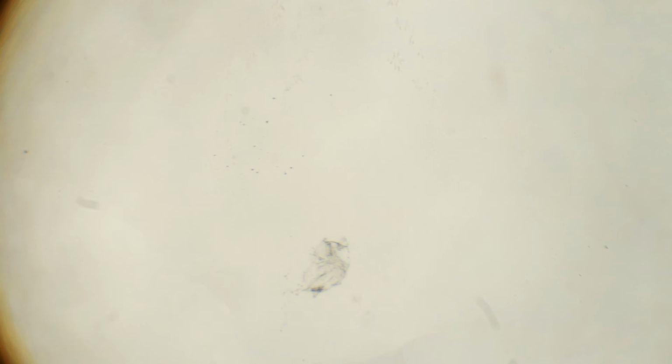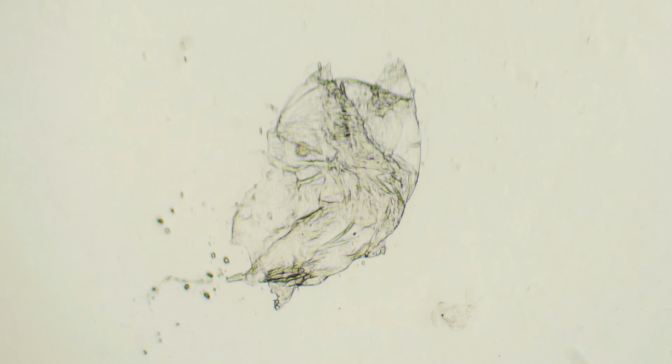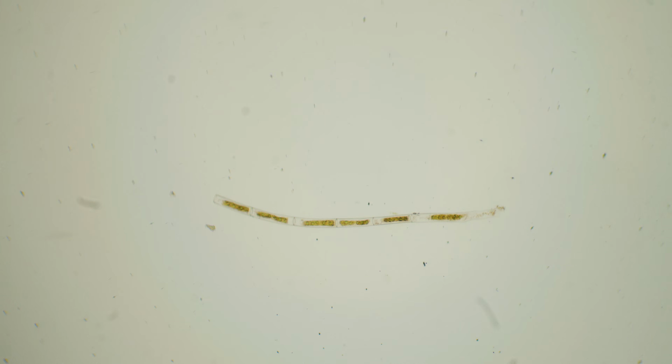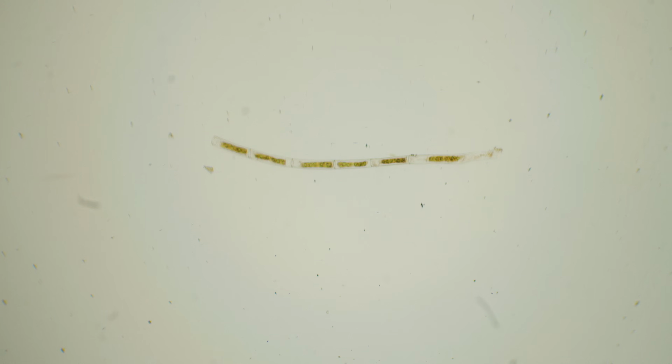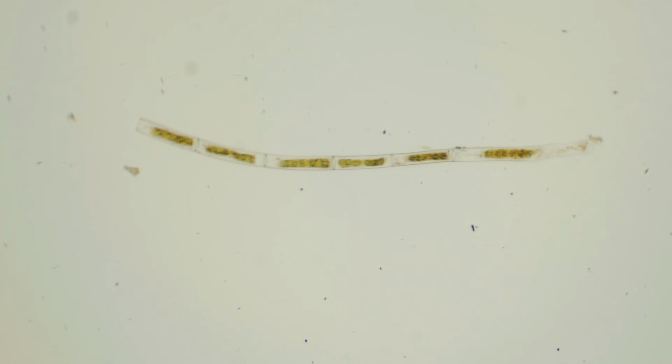Wait a second, what do we have here? This looks like a microscopic shell or casing from some microorganism. But even if that is true, this water visually looks cleaner than the water after boiling. You'll find out the results from the frozen water at the end of this video. As I continue studying this drop of water, I made the microscope light darker and increased the magnification to check for very tiny microbes. And what do you think? It turns out they are still here, even in this filtered water.